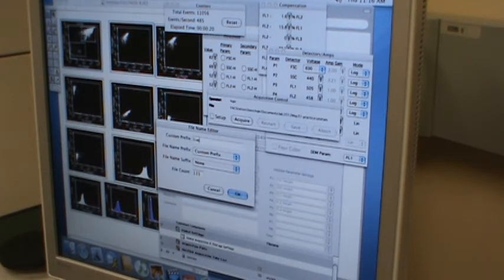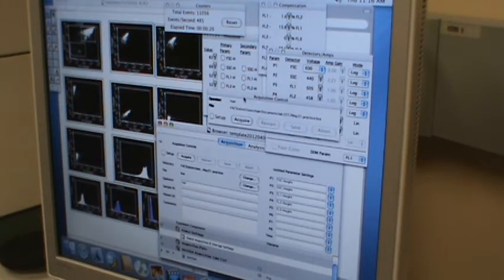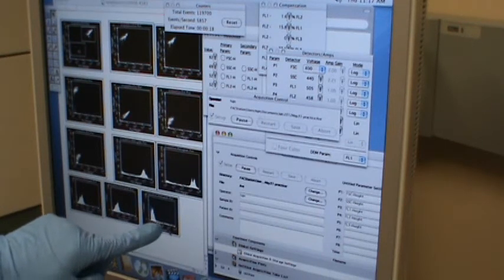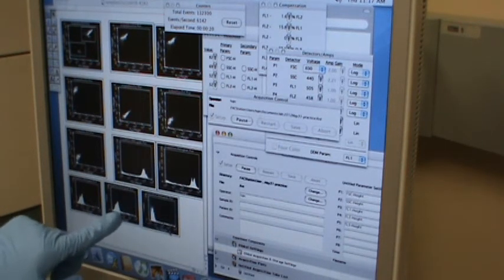So let's see. I'm not sure right now, so I'm going to click setup just to see whether the signal is right or not. Okay, acquire. This is a live cell, so I should see no signal. I should see no red cell, very few red cells. That seems to be good. See? Red should be in channel 2 or 3.